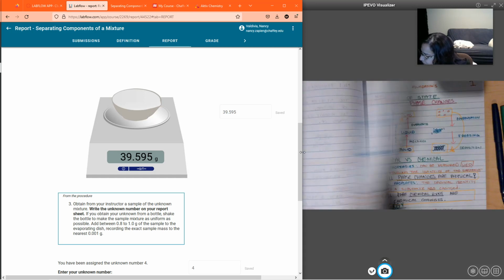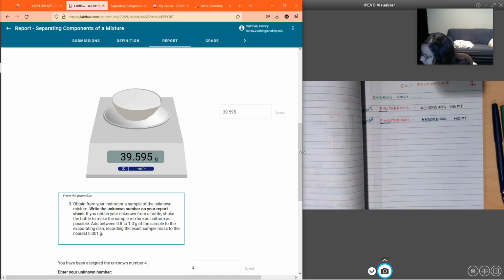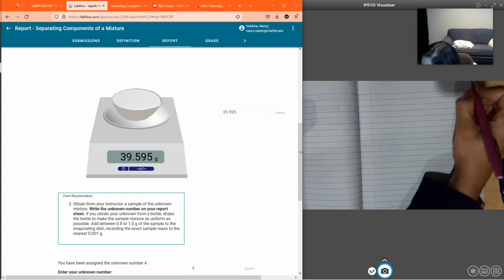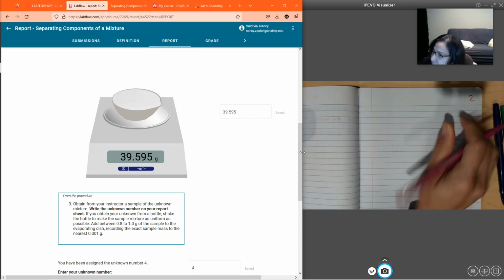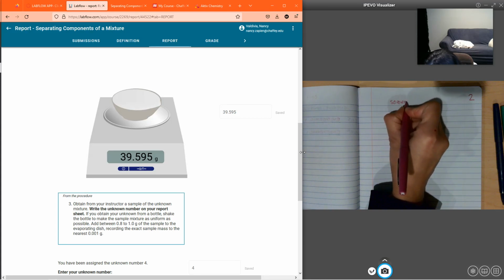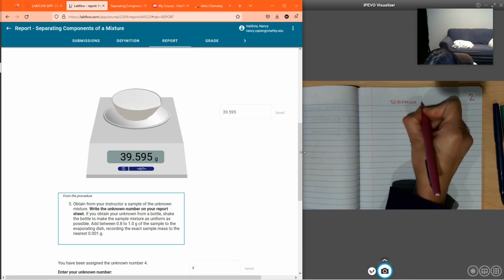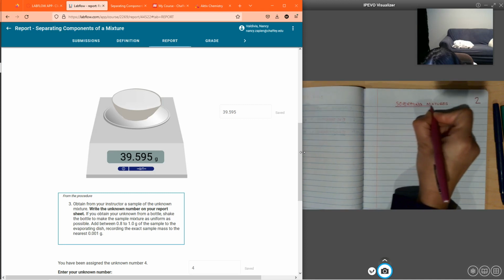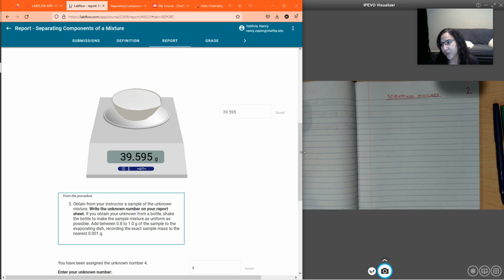So this is going to start my new assignment, number 2, right? You always want to write down your information.